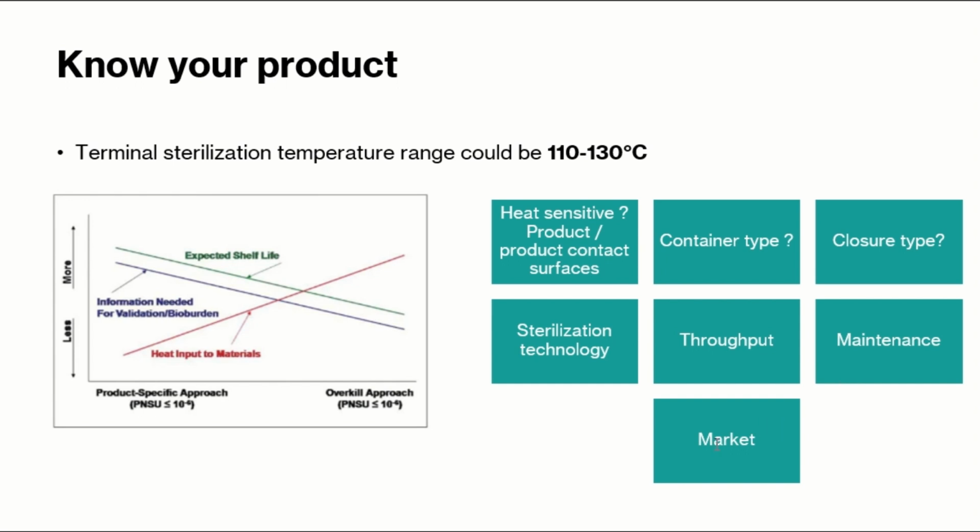Based on the market you could use different approaches to sterilization, and sometimes it's different from the US to Europe. So when you make a plan, like how much FO you need, what the strategy of your sterilization is, and what documents need to be submitted for regulatory scrutiny, it could depend on the regulatory requirements from country to country and region to region.